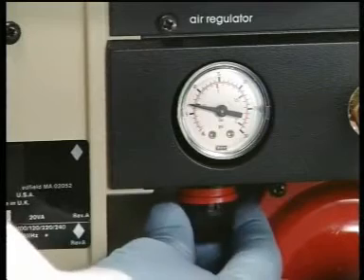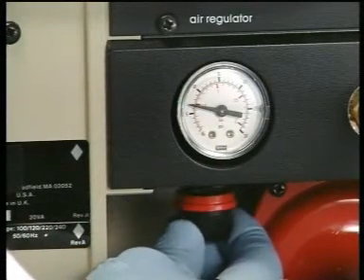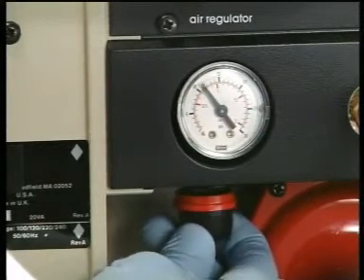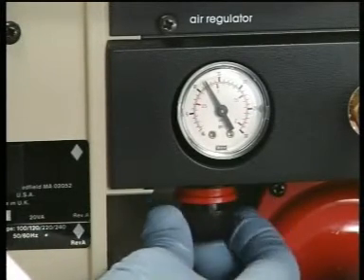Before making any readings, unlock the air valve and adjust the air pressure to the value recommended in the instrument manual. Then lock the valve.